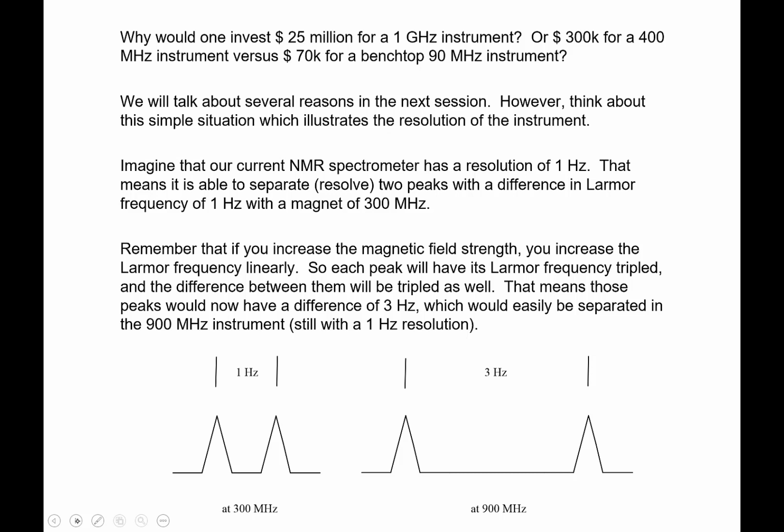I'm not going to go to Case and say, hey, can you give me some 900 megahertz NMR time to measure the spectrum of anything I need? No, because we could get away with that at 60. But if I'm doing structural work, structural biology, biochemistry, molecular biology, and I want to look at a protein, I have no choice. I've got a minimum of 600, then 900.